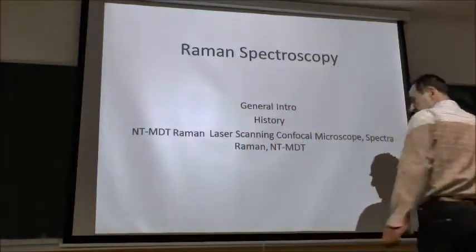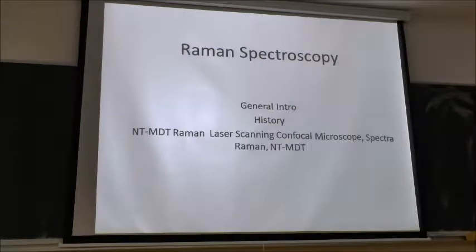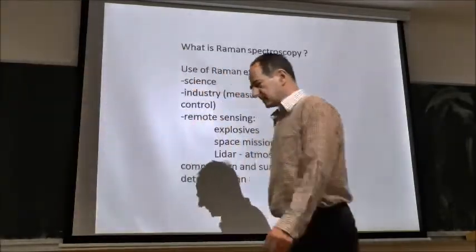Okay. So I will tell you something in general about Raman spectroscopy. Then a few words about history, and then about the spectral Raman. This is the instrument which we acquired in our center. So what is Raman spectroscopy?